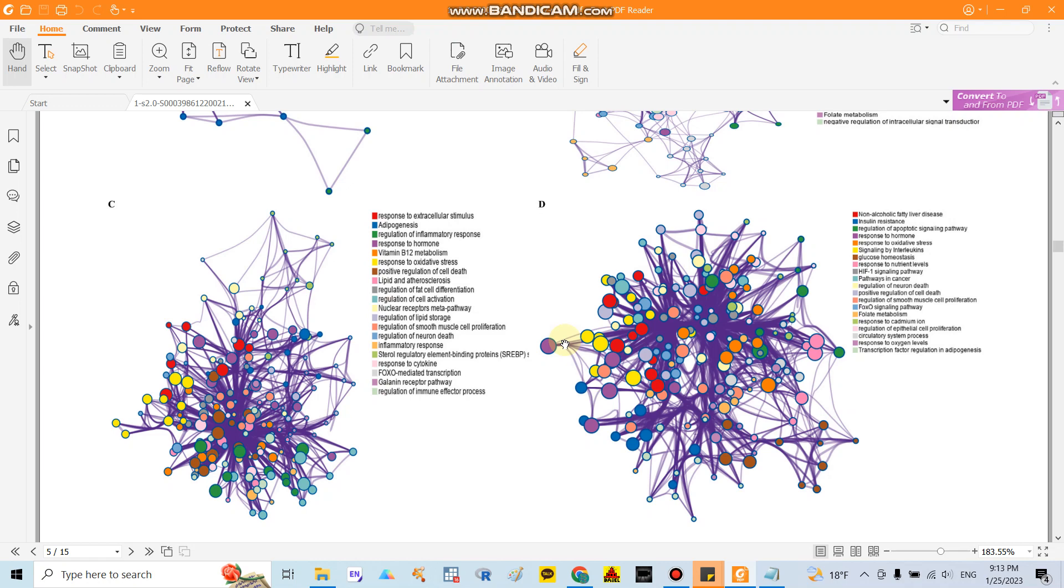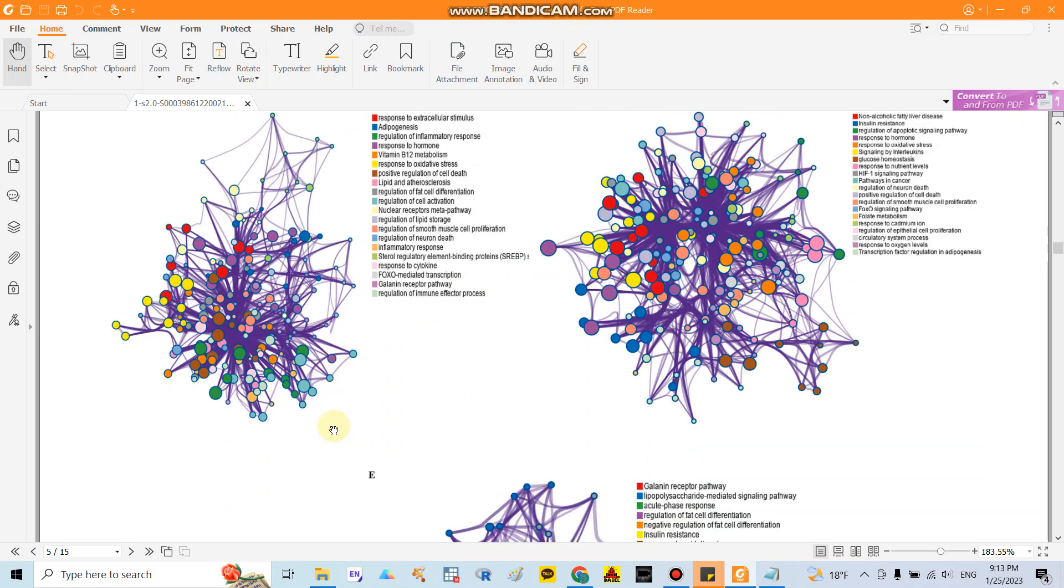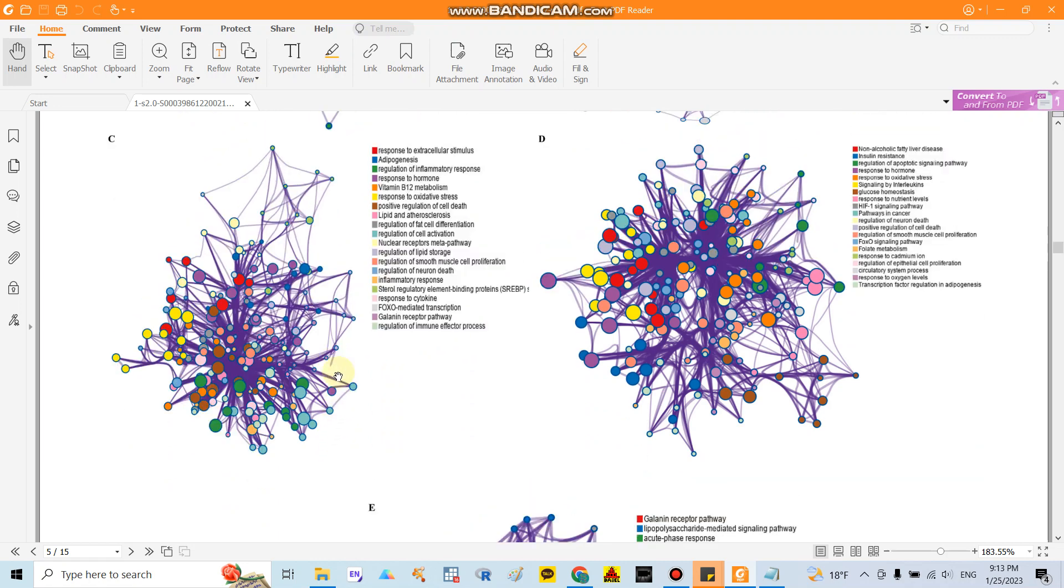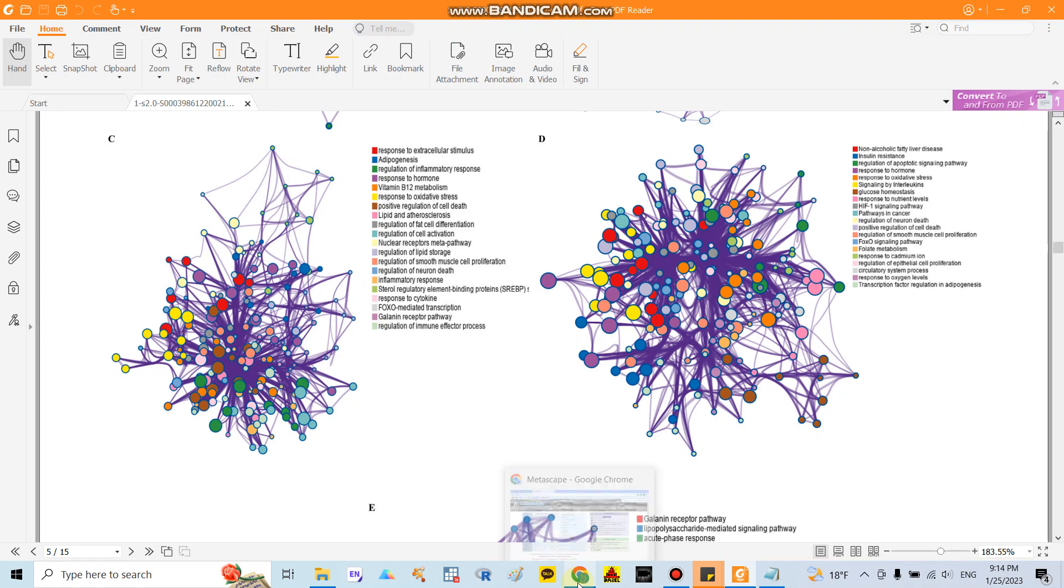Good morning everyone. Today I would like to show you how to present data, calculate the protein production biological process, or the pathway using Metascape website.